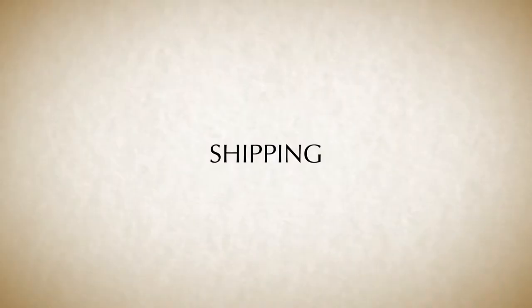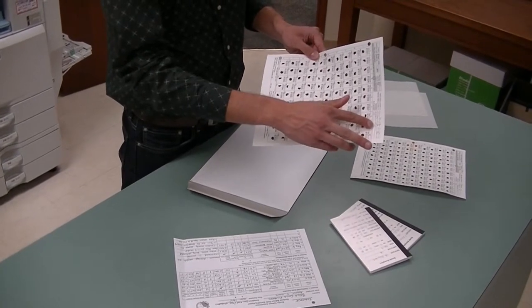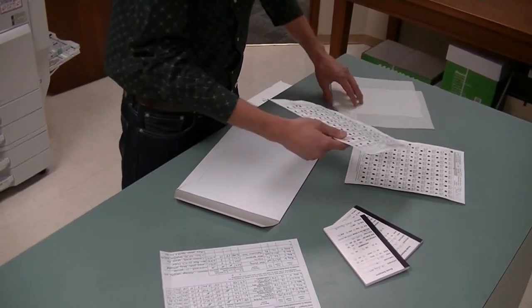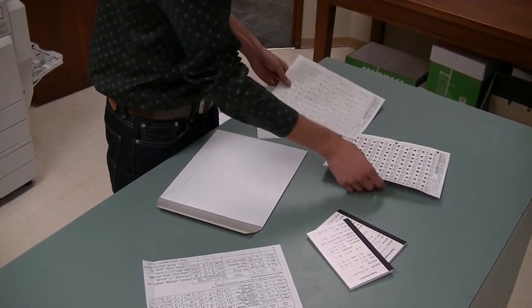Once the samples are collected and you have double-checked that all forms have been filled out, the samples can be shipped for analysis. A major advantage of Wattman sheets over ethanol kits is that they are lightweight and do not contain any hazardous substances, so they are much easier to ship.